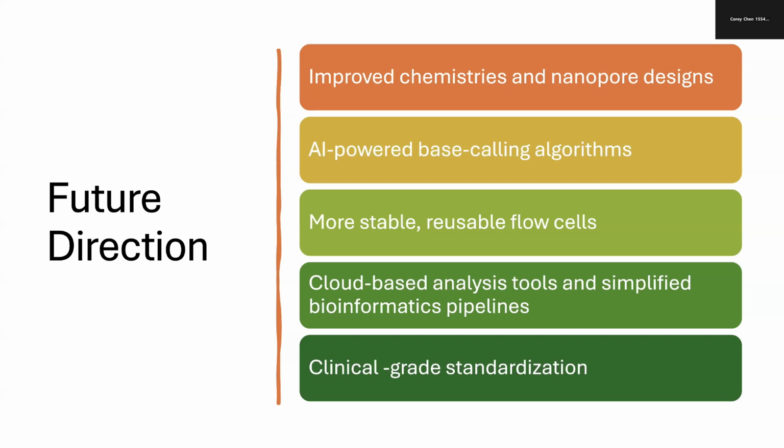Third, developers are working on more stable, reusable flow cells to improve output consistency and reduce costs. Fourth, cloud-based analysis tools and simplified bioinformatics pipelines are making data analysis more accessible. And finally, Oxford Nanopore technology is moving toward clinical-grade standardization, with efforts to validate workflows for diagnostics and pathogen detection.